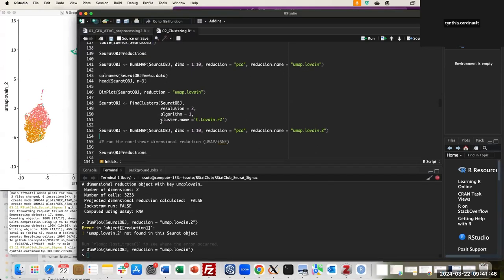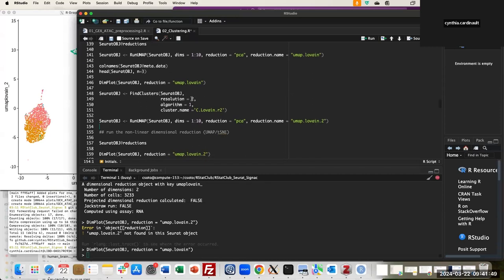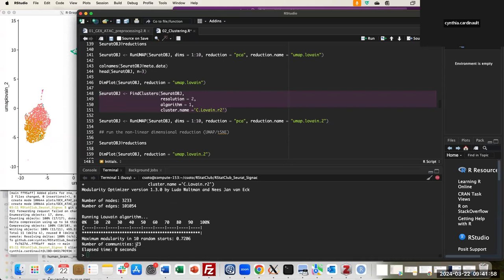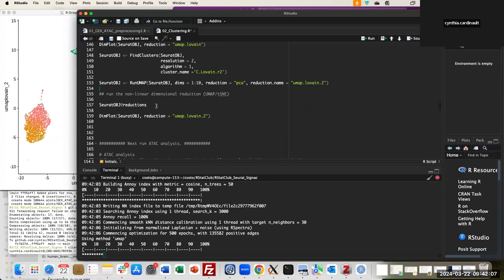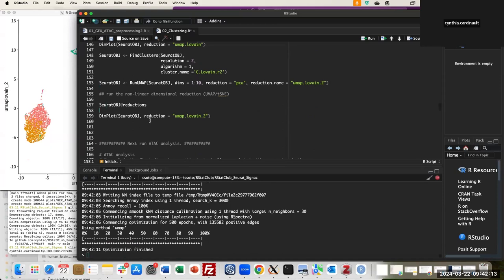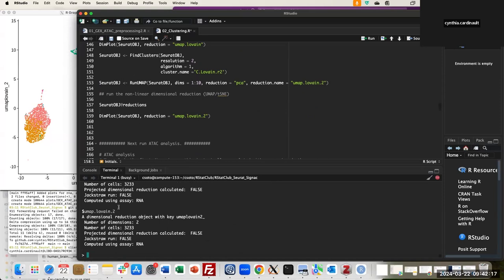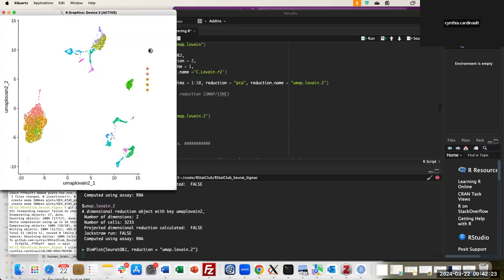Here is another example running a different resolution. I increase the resolution to 2 because I want smaller clusters, and now I have 23 communities. I run UMAP to visualize them. You can look at the reductions — for example 'Louvain_res2' as the name. Then you can look at this new clustering with more detail. This is all for the gene expression data.